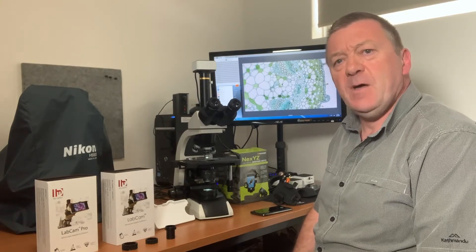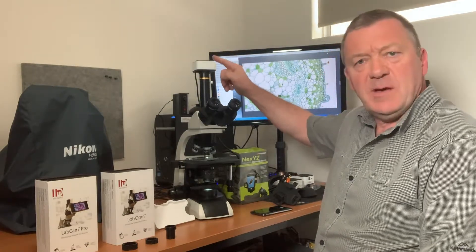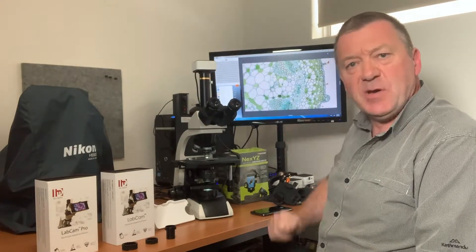Hello, I'm Stephen Wilkinson from microscopes.com.au, and today I'm going to do a review on three different types of microscope iPhone adapters and compare them to one of our dedicated digital microscope cameras that attach to this microscope.